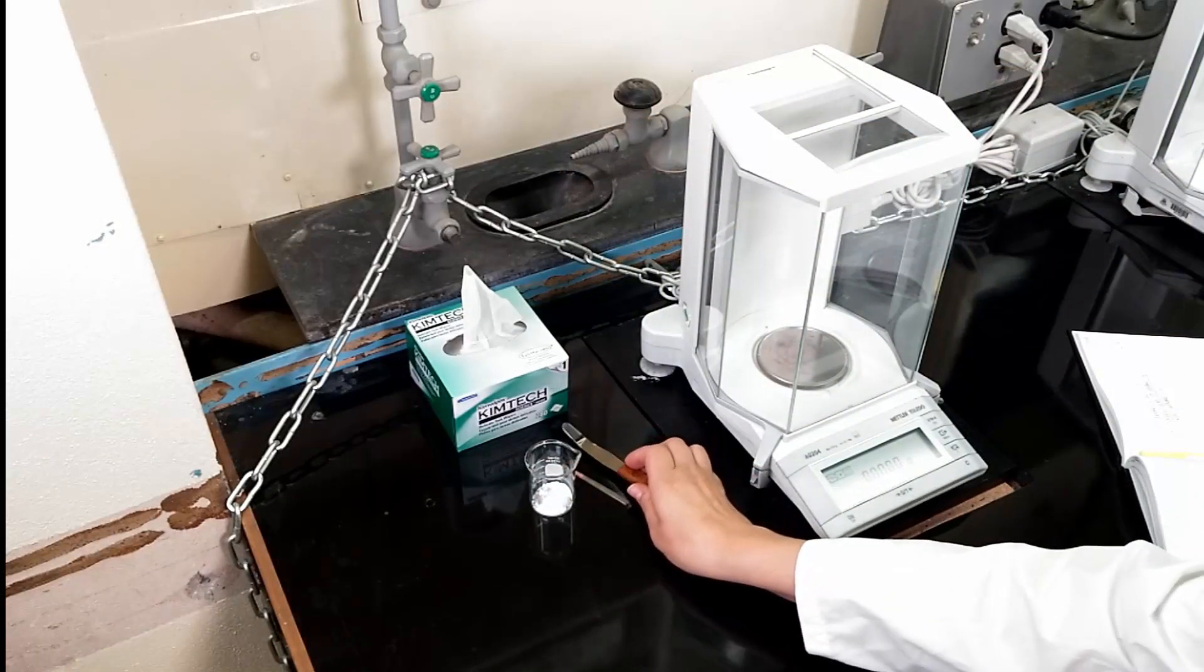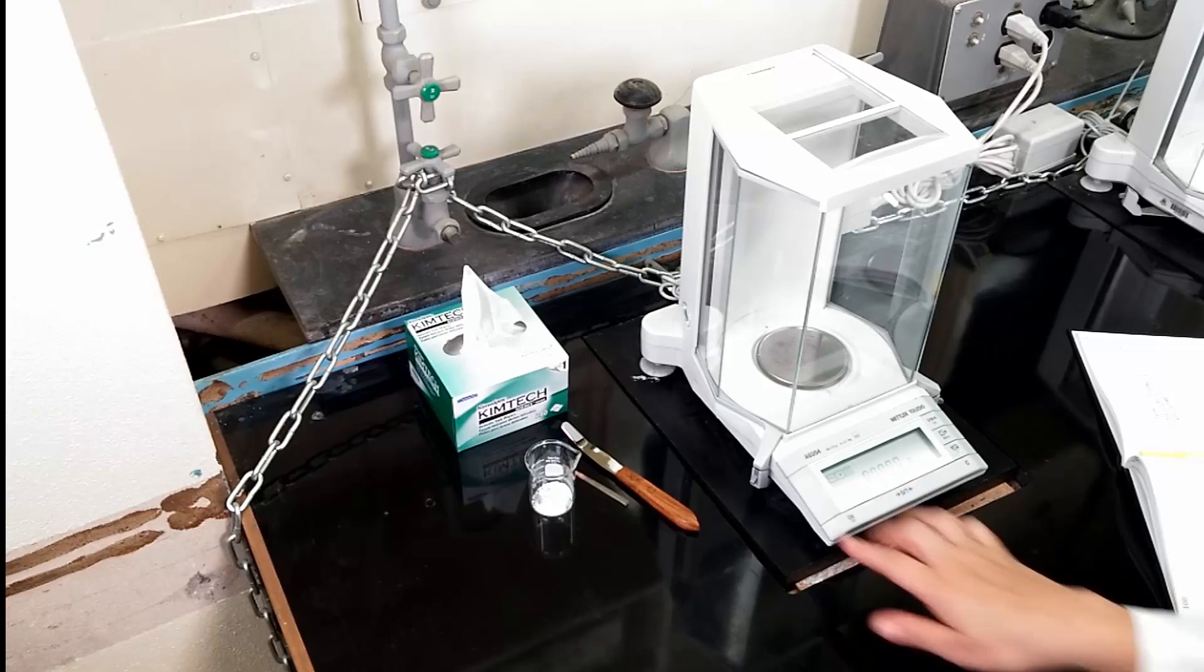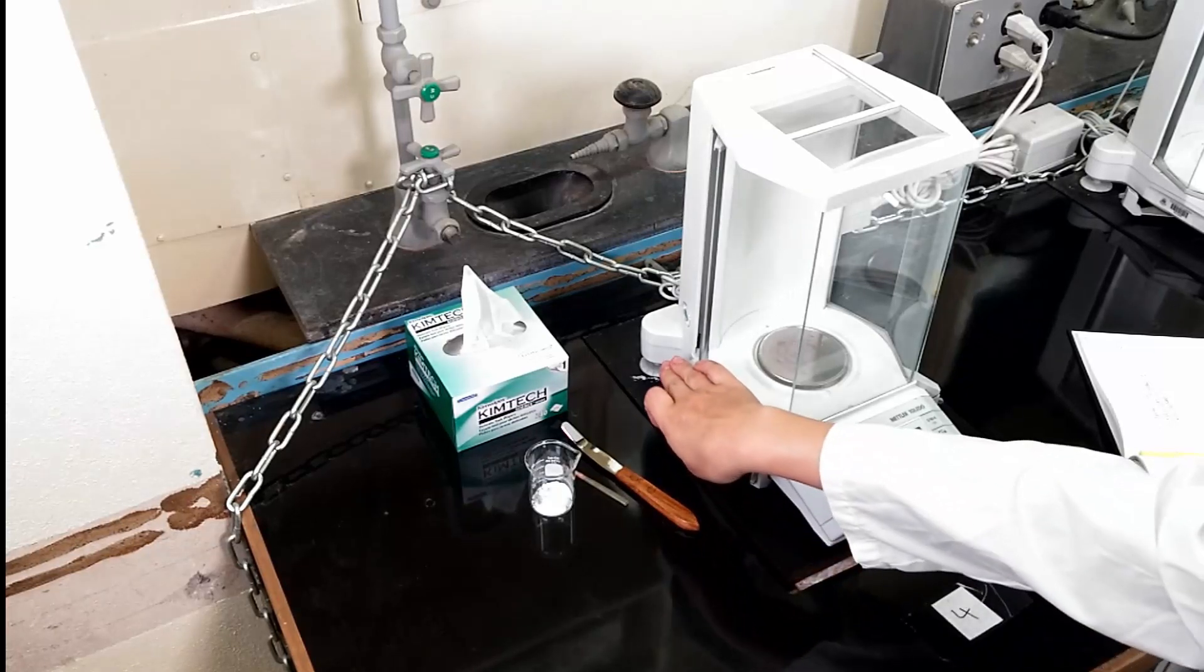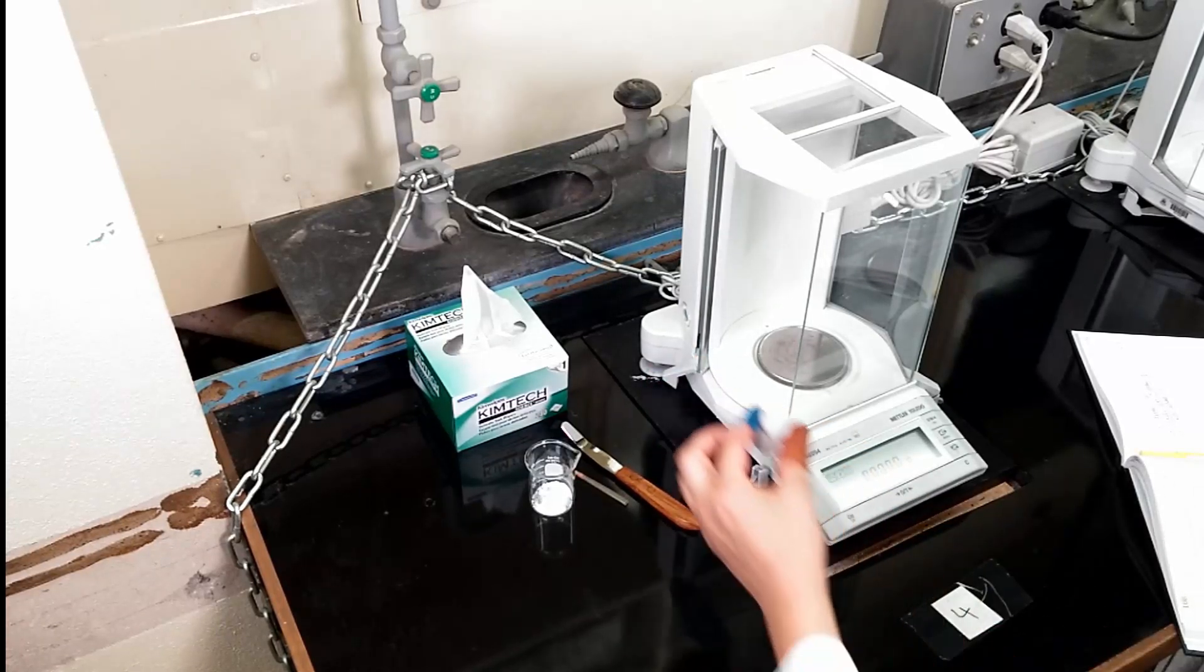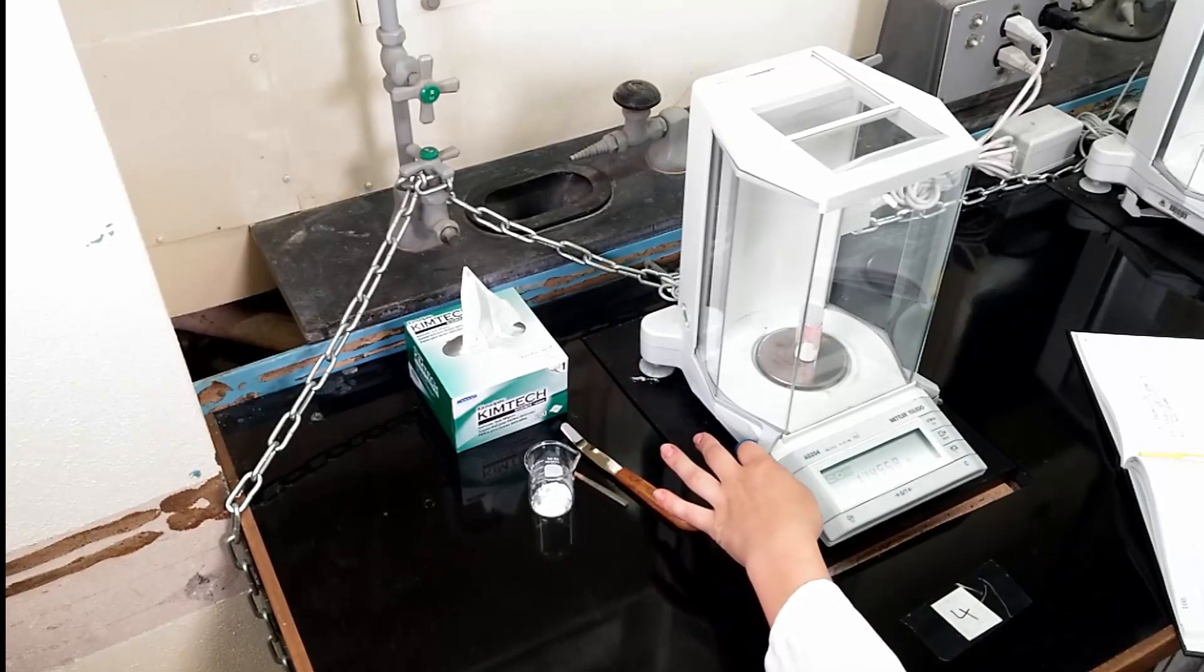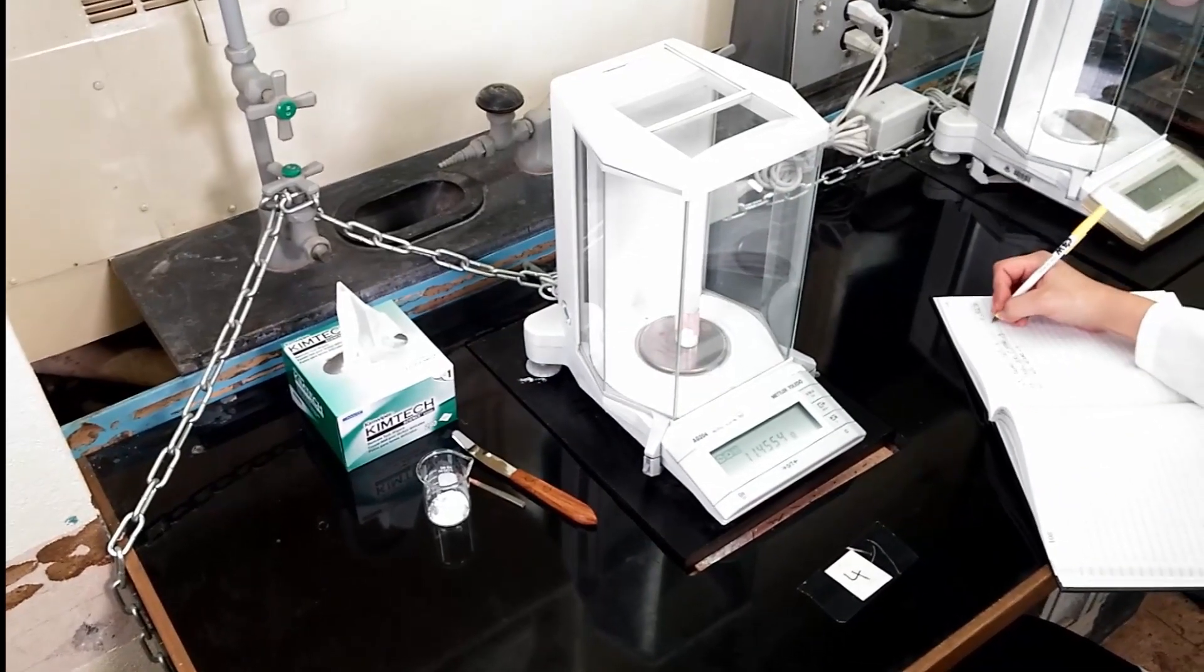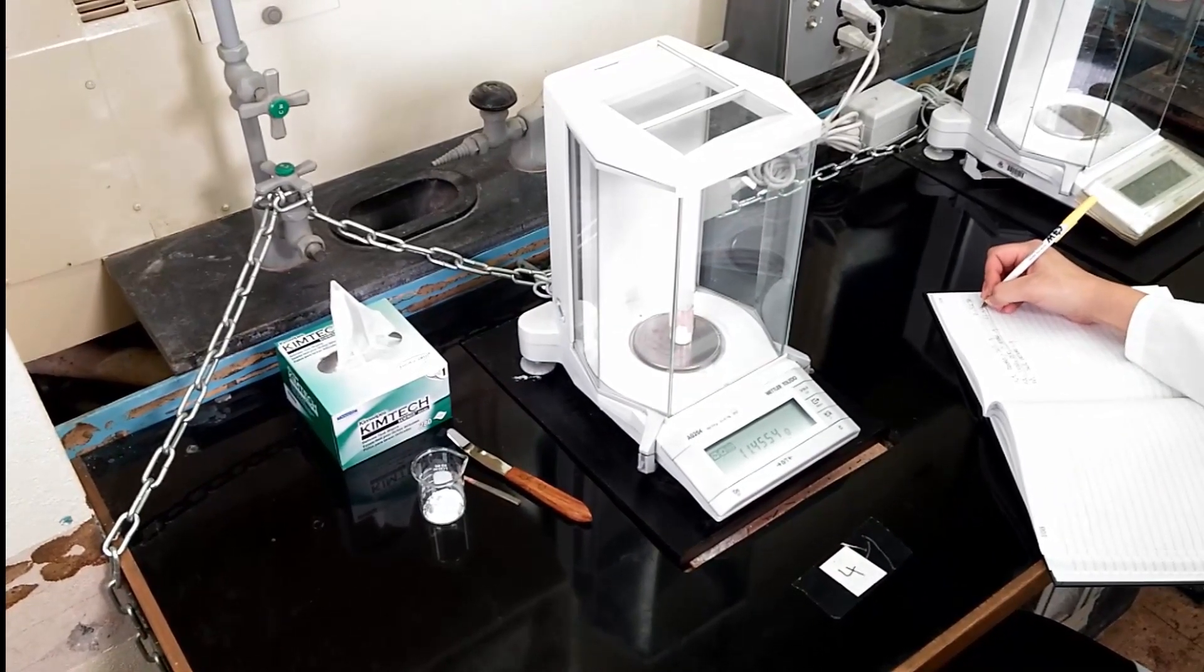Lastly, reweigh the container by zeroing the same analytical balance used to weigh the initial container mass. Place the container onto the center of the balance pan and close all doors of the balance. Once a stable reading is achieved, record the mass in a laboratory notebook.